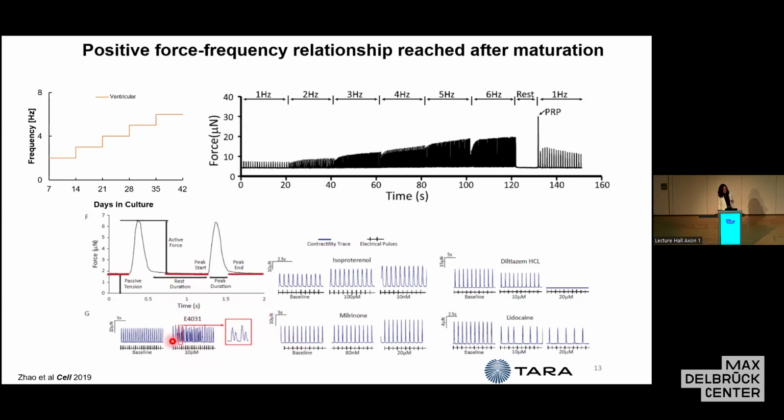And you can see the drug that blocks this hERG channel causes very, very dangerous rhythm disturbance. That has actually happened with some drugs post-approval, such as Vioxx. And Vioxx, for example, killed about 27,000 people in the United States alone. And this shows you that a platform like this is capable of picking up effects of known drugs.